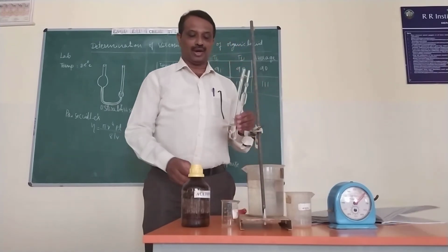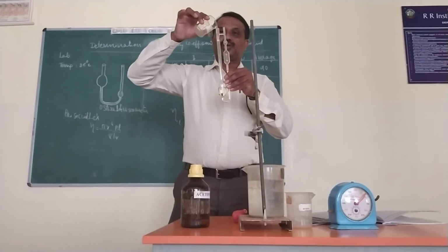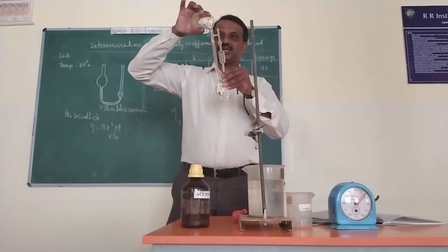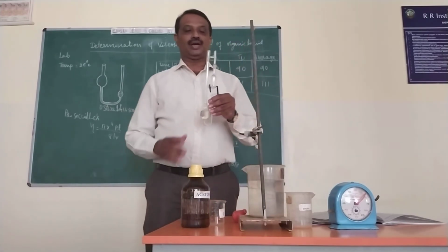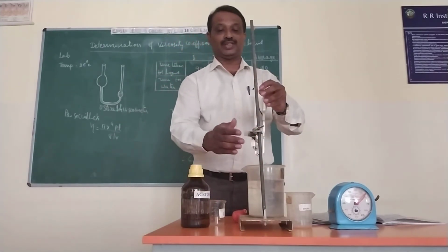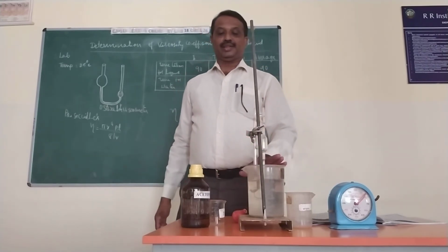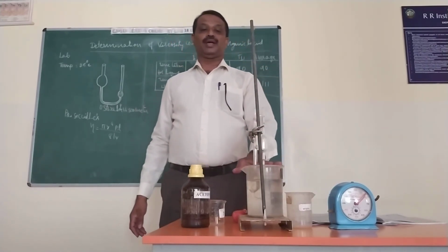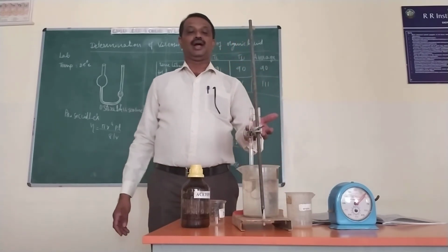So I have taken one of the organic liquids. Slowly I filled it into the large bulb of the given viscometer. Afterwards, I will fix it to this burette stand, and we can prepare this water bath. We have taken a 1 liter beaker containing tap water.